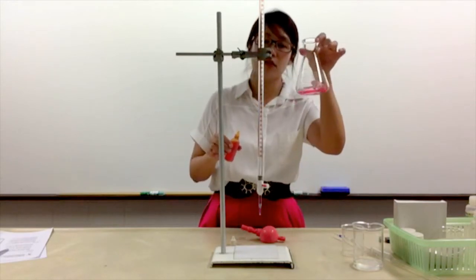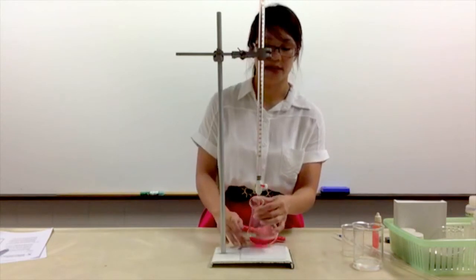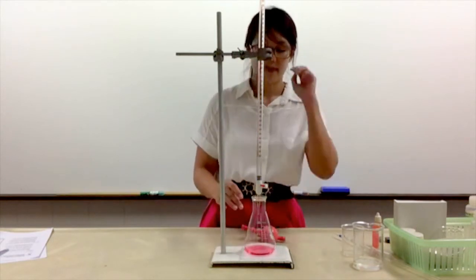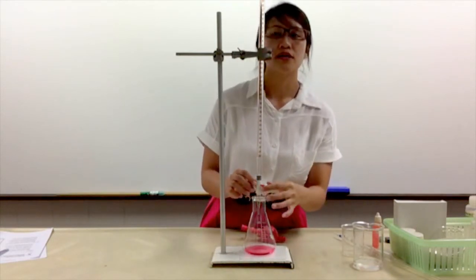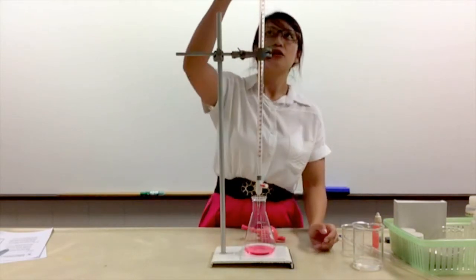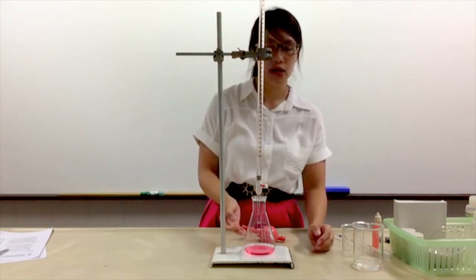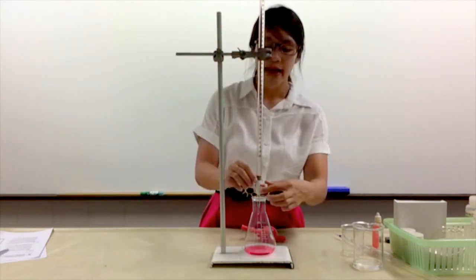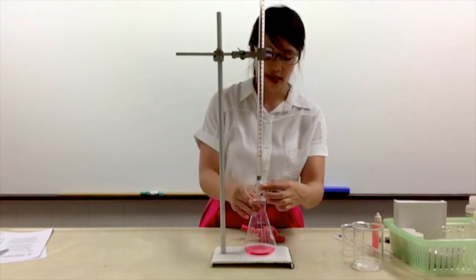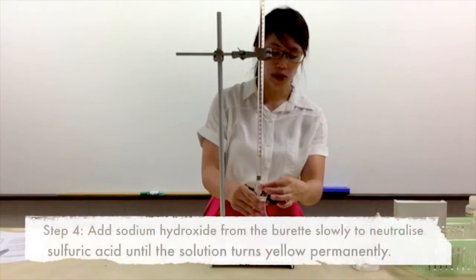Next, place your conical flask below the burette. Now you will start the neutralization reaction. Once you open the tap, your alkaline will start to move downwards and into the conical flask, and the acid and alkaline will start reacting. You need to do this slowly.